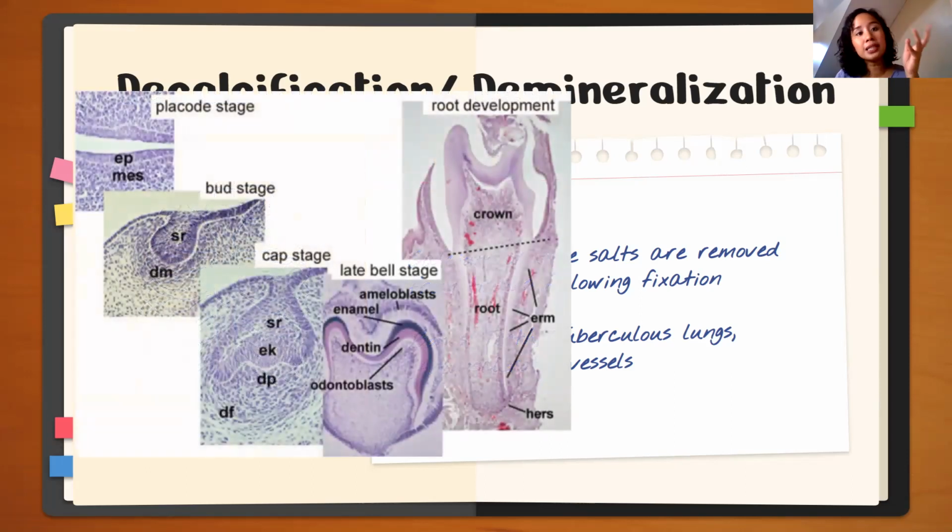So guys, this is an example of an image of a slide, focus under the microscope of teeth. Class, kaya tinatanggal natin itong calcium and lime salts kasi masyado itong matigas for the knife in our microtome. When you cut a tissue with calcium, it could damage the sharp edge of our knife.